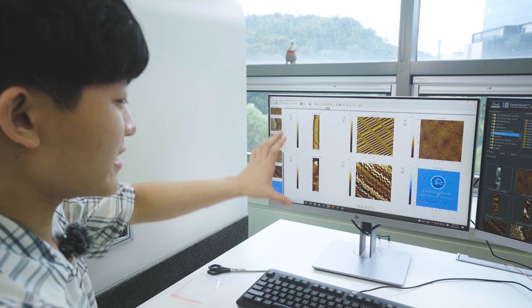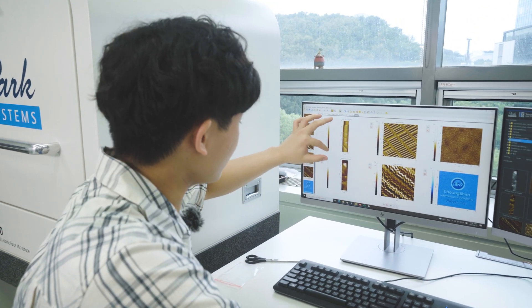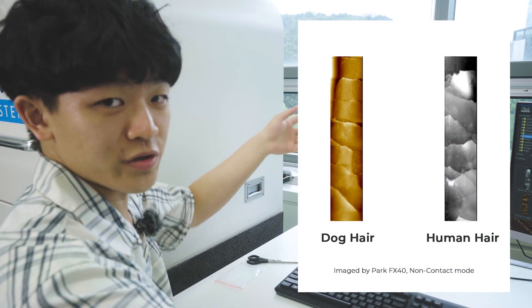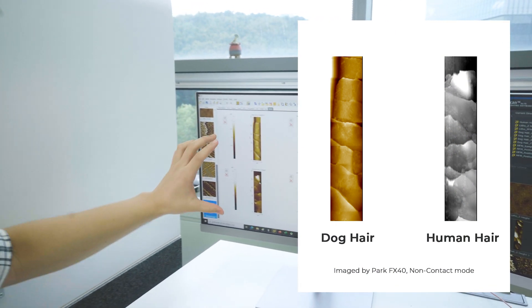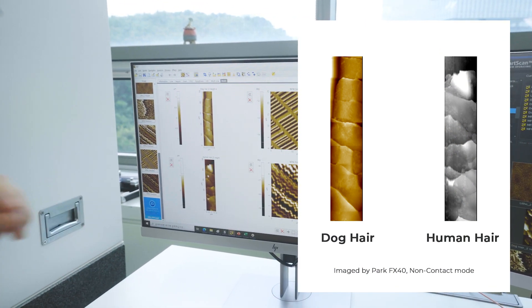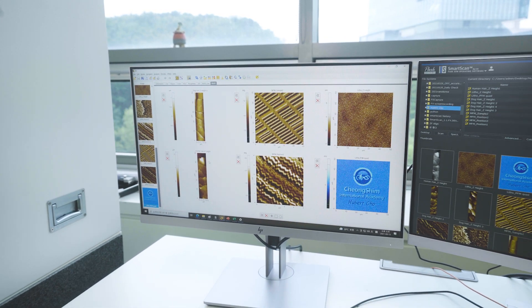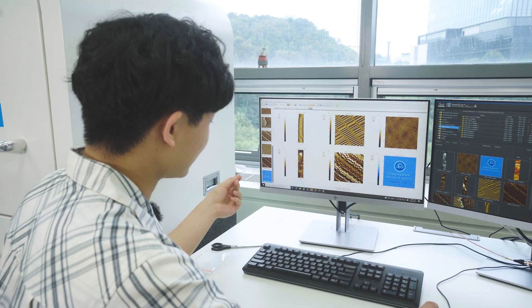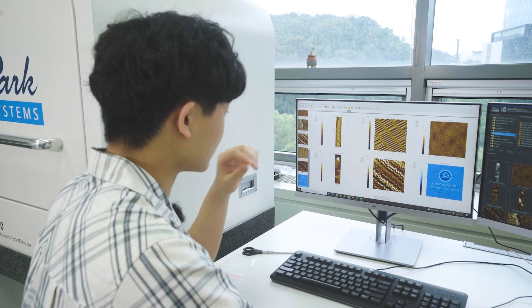Here we have the images that I scanned today organized. First, we have the dog hair and the human hair. I first brought the dog hair thinking that up close they would look very different, but now that I've actually scanned it, we can see that they actually look pretty similar. This is the first time I've seen a hair up close and I was pleasantly surprised to see it's not as smooth as I originally thought — we can see the rough layers in between.